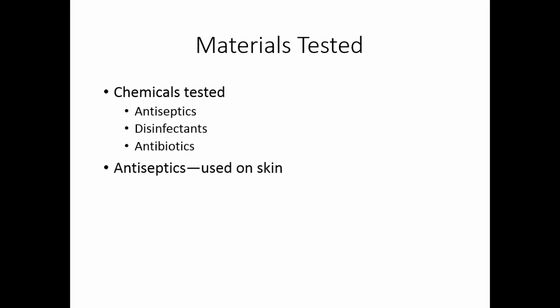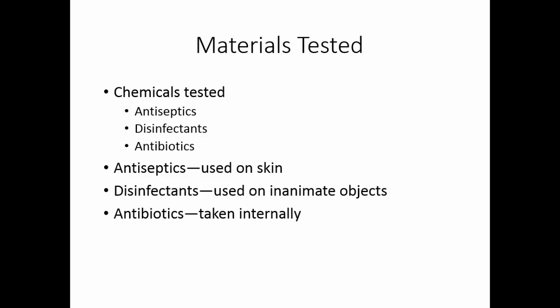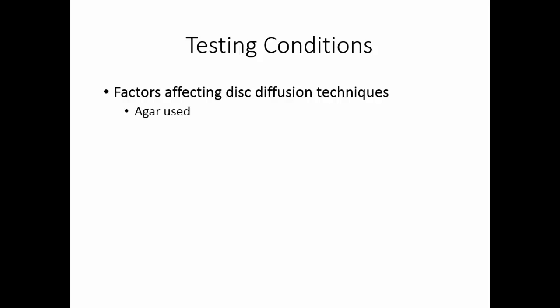Antiseptics, you'll remember, are chemicals that can be used on skin. Disinfectants are used on inanimate objects, and antibiotics are taken internally. When we're testing, there are certain factors that will affect the disk diffusion technique. One is the agar used. Different agars will give you different results.